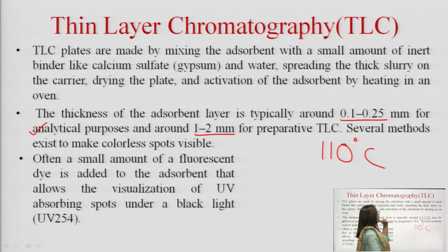As already mentioned, preparative TLC is utilized for isolating the analytes in a higher or larger amount. Sometimes this isolation could be at the gram level as well. Again, preparative TLC is utilized for production or manufacturing of active pharmaceutical ingredients for analytical purposes, and they need to be obtained in a purified form. At that stage also preparative TLC is utilized.